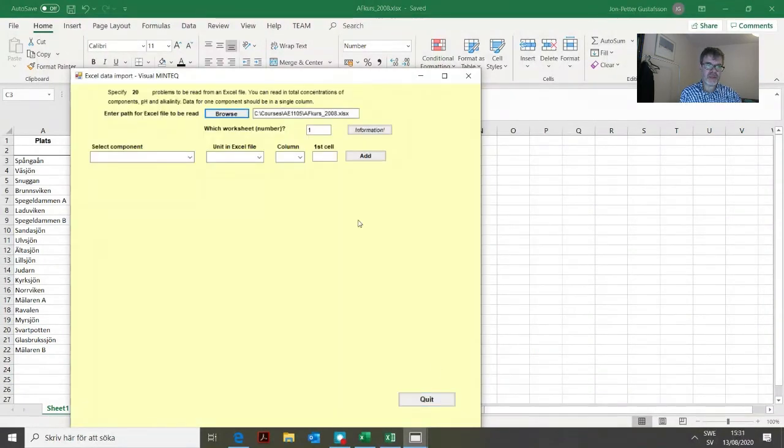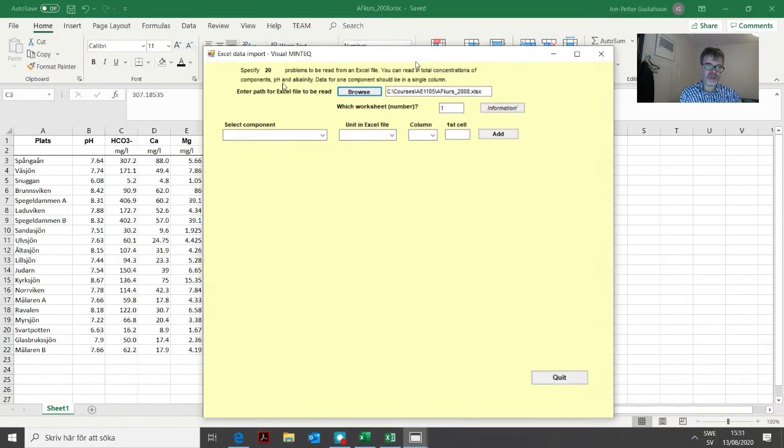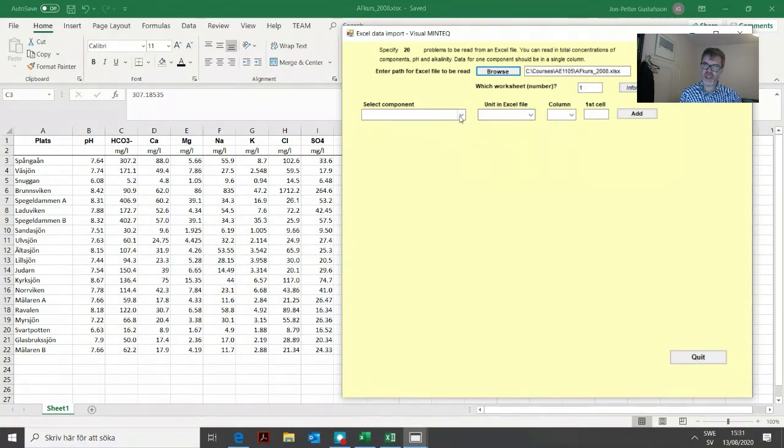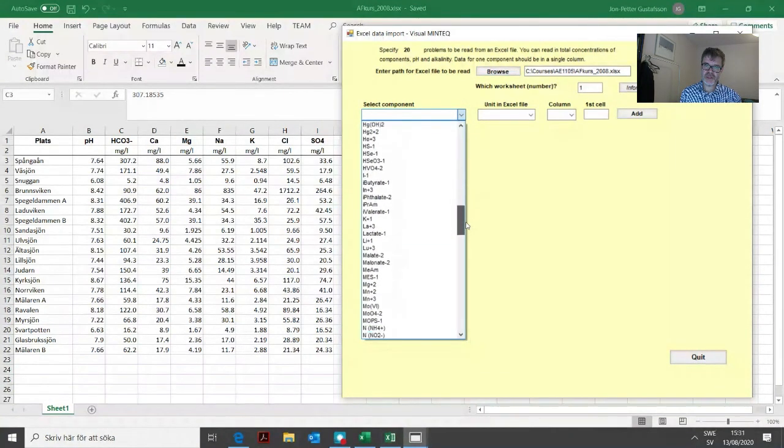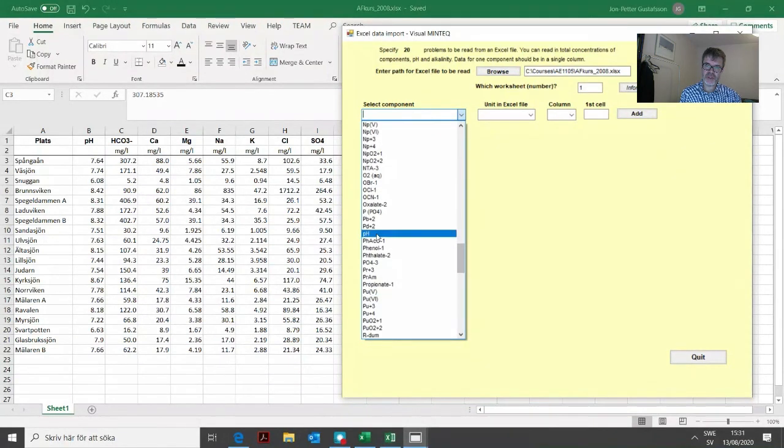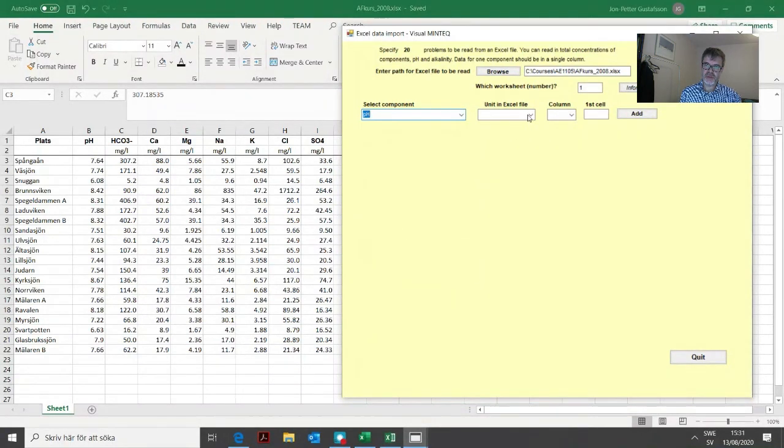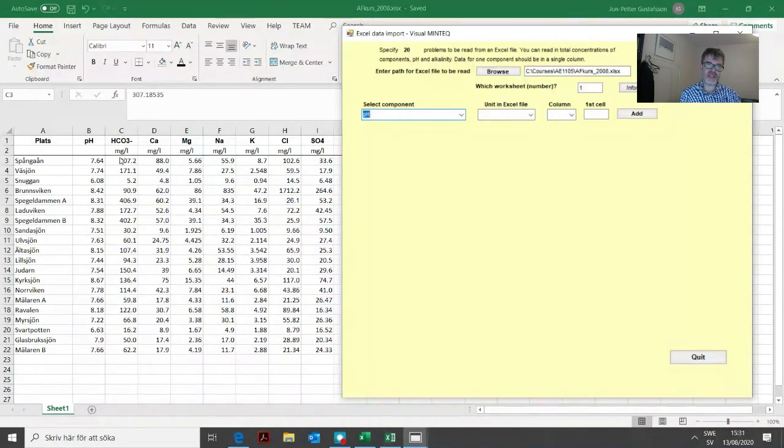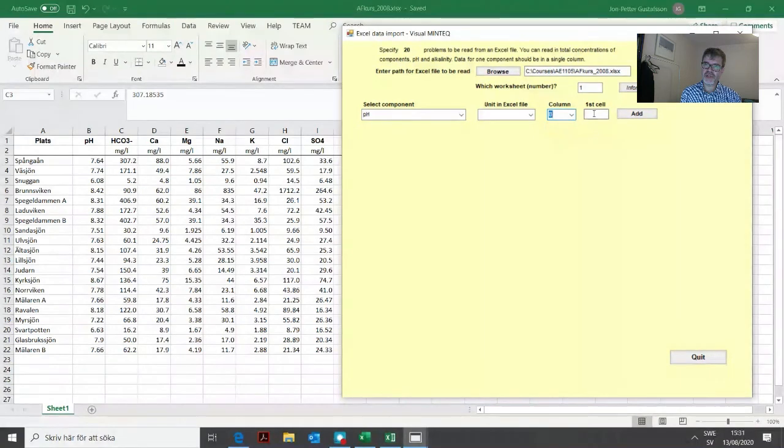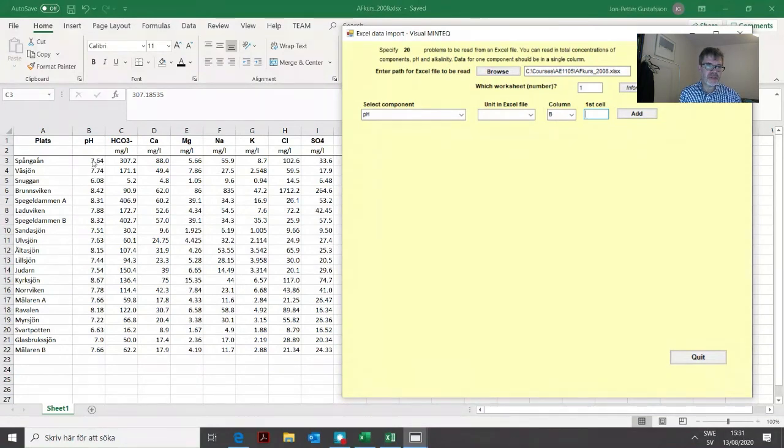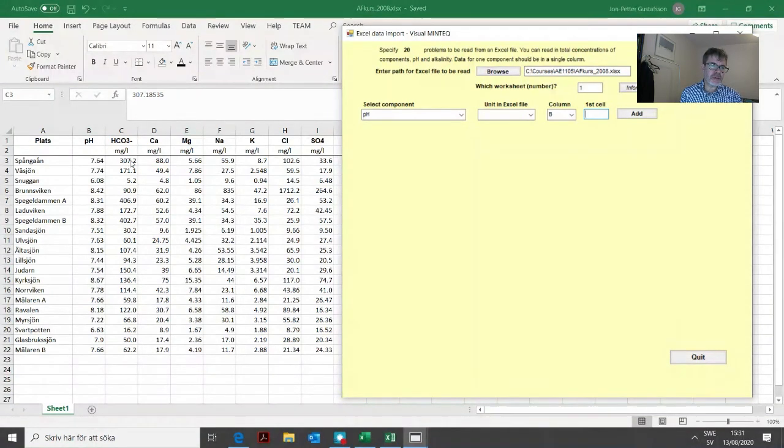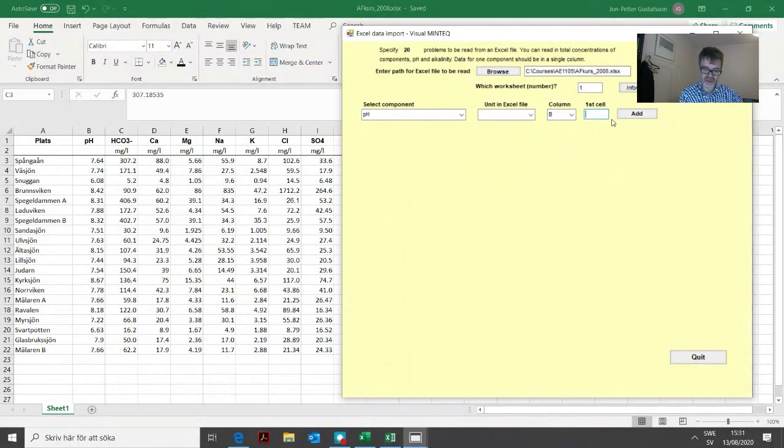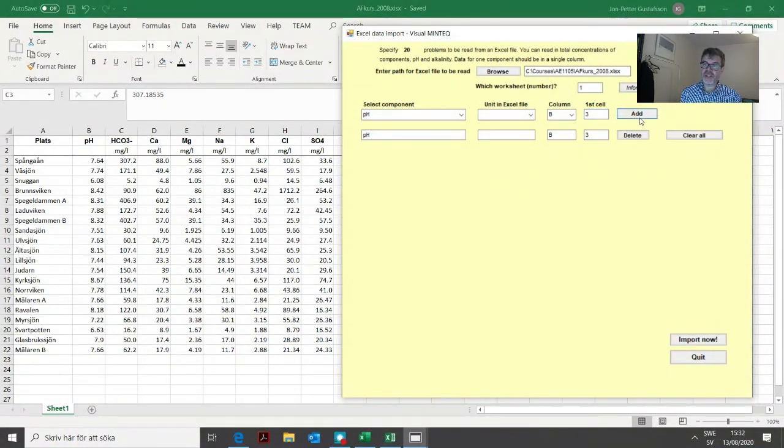Then we simply choose what we need to have. We have pH, so we need to define that. It has no unit but is present in column B. The first cell is the row number where this array of data starts, which is number three. So it should be B3 there. We click add.